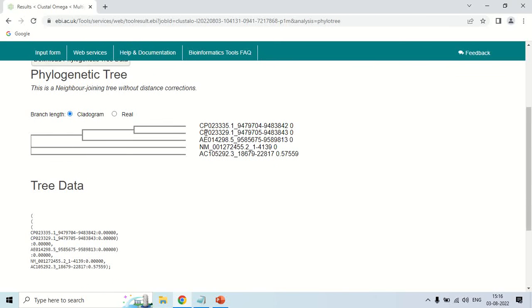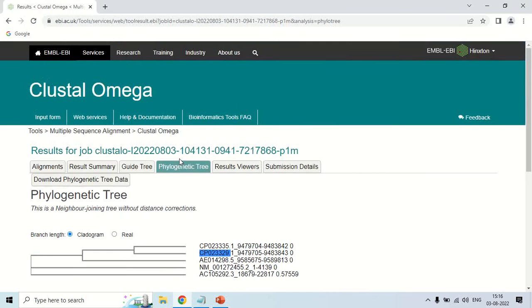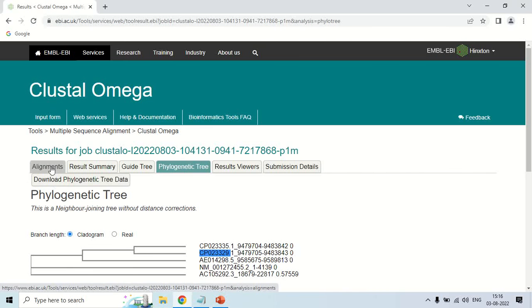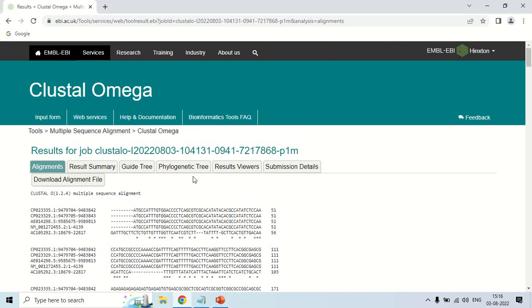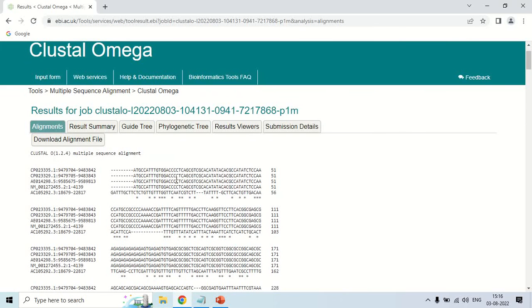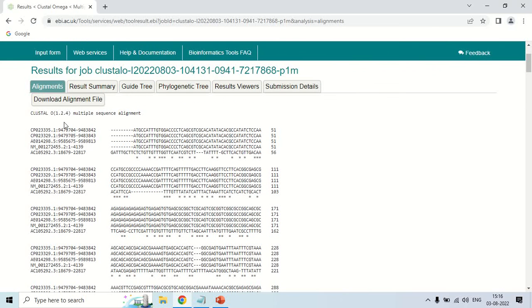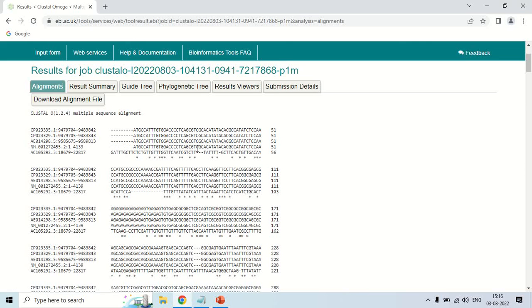You can see the phylogenetic tree — it is a cladogram showing the five sequences with their accession numbers like sequence one, sequence two, and so on. By clicking the 'Phylogenetic Tree' tab you can also see this tree. Coming back to the alignment tab, click 'Alignment' to return to the alignment page. The 'Download Alignment File' option will download this alignment to your system. In this way, you can use Clustal Omega for multiple sequence alignment as well as for phylogenetic tree construction.